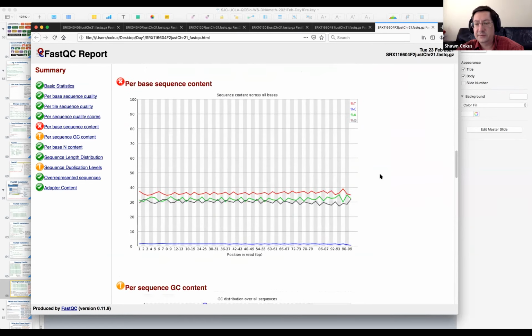This is a very, very important chart for BS libraries. It shows, for each position in the read, the ACGT base distribution. You line up, stack up all the reads, go to position 37 or whatever you're interested in, take all that pile of ACGTs from all the reads and histogram it. What we see is exactly what we expect from a bisulfite library in human. The C percent in blue is very, very depleted. They all got turned into Ts. The As are in green.